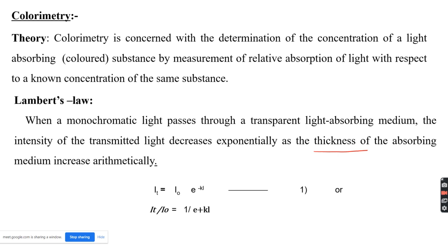To detect the light absorption, we have to pass a known wavelength of energy. So how will we choose the wavelength? How much wavelength of light energy should pass during the experiment? Again, that is trial and error. We pass different wavelengths of light, and the one which absorbs the maximum light energy is the wavelength we normally choose.